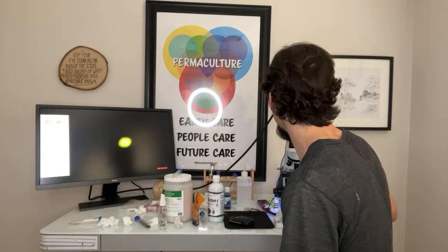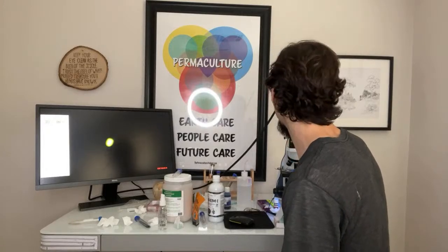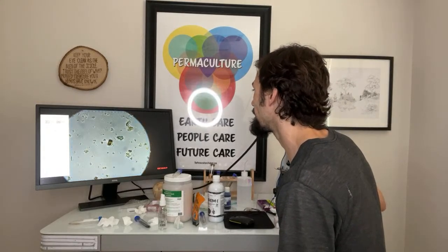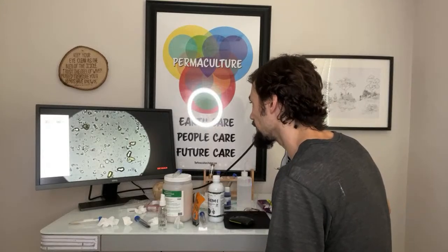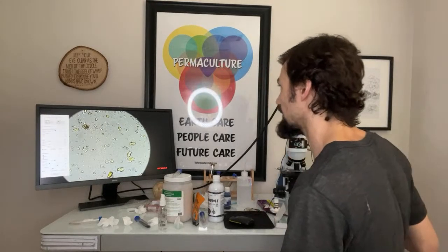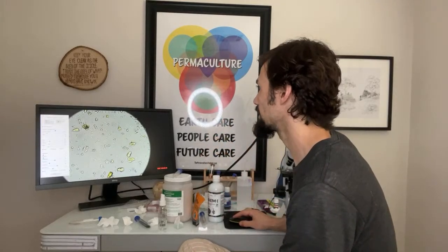Oh wait. But do you see how it's kind of weird? I bet you anything it's an imperfection in the glass. No, it's a mineral. It's a mineral that's very reflective. It moved when I tapped the slide. You saw me tap the slide, right? That's one of the surefire ways you know if it's on the glass or if it's in the medium. All right.